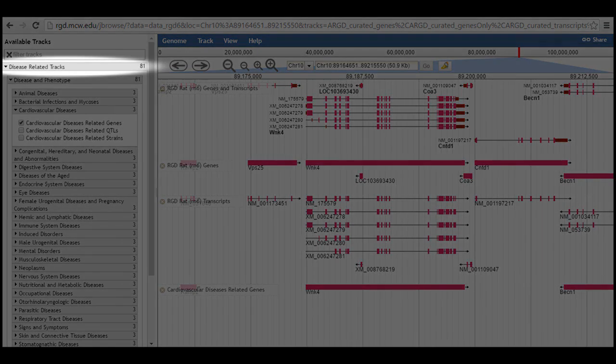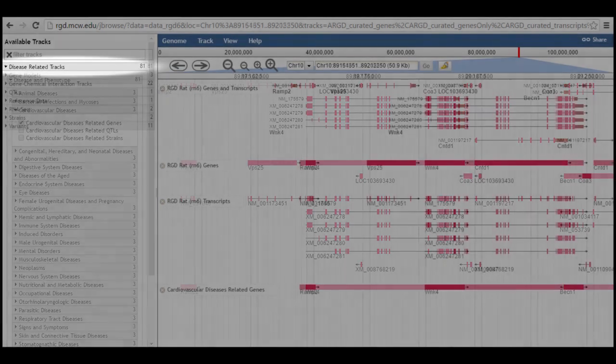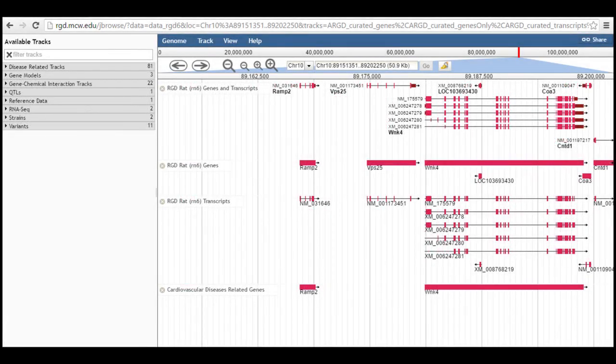Click on the track category header to collapse the list of tracks in that category. Doing this does not turn off any previously selected tracks. At this point, the view in the browser shows four tracks.